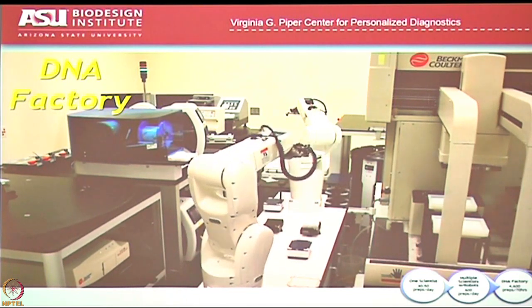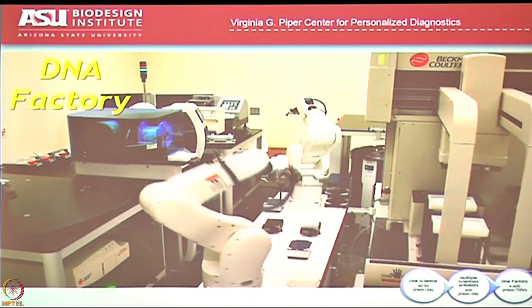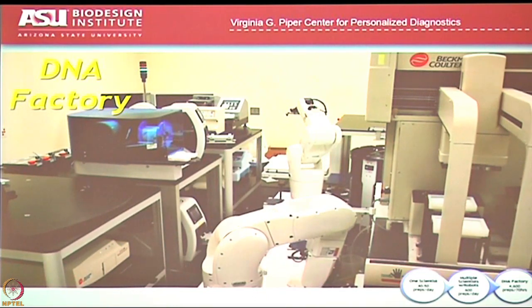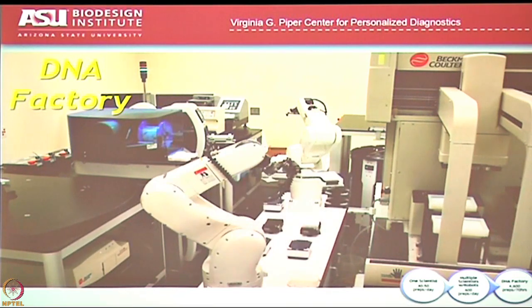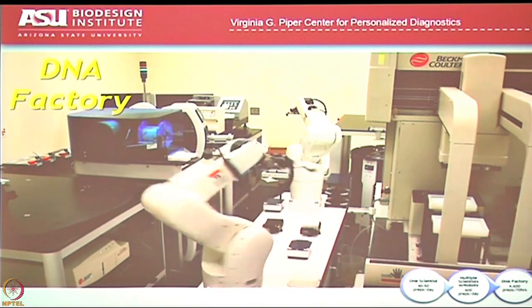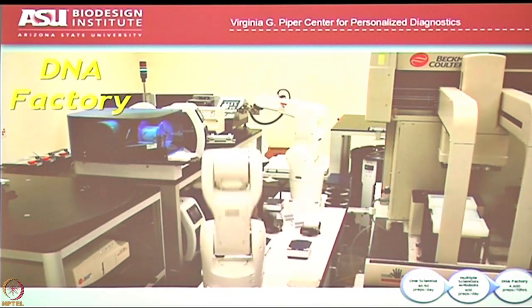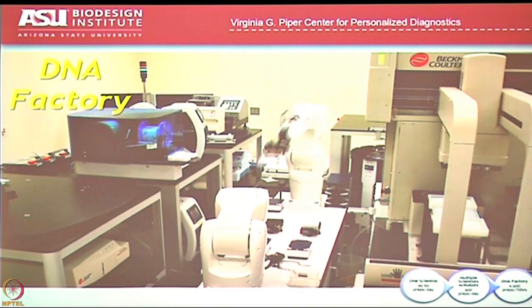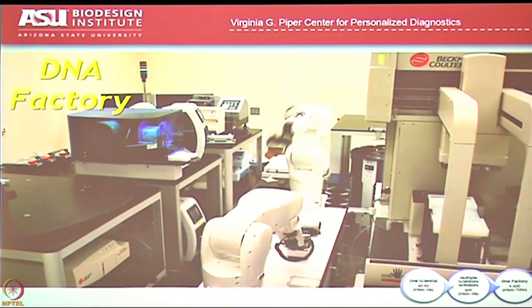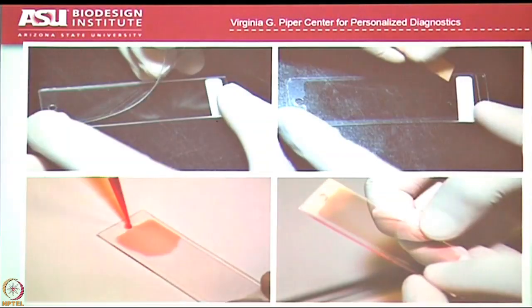There's a barcode reader right down here, which you can't see, that checks the barcode of every plate to make sure that it's what's supposed to be. And then this device over here will read the optical density of the DNA after you've made the DNA, the OD260. So we can actually measure how much DNA we're making, and the robots will automatically adjust the concentration to make them what you want them to be. So all in all, we went from doing 50 mini preps a day to 600 mini preps a day, to now 4,600 mini preps in 70 hours, start to finish, growing bacteria to getting purified DNA. So it really accelerates what you do, and it also gives you a little bit more certainty that what you're doing is working.